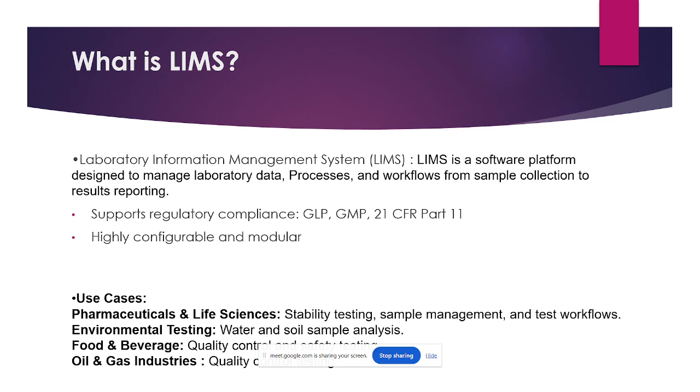In pharma, in the QC laboratory, LIMS will be useful in QC testing. When you are doing QC testing, whatever data is generated in the QC lab will be managed in the LIMS application. For example, in intermediate, everyone has studied intermediate, right?